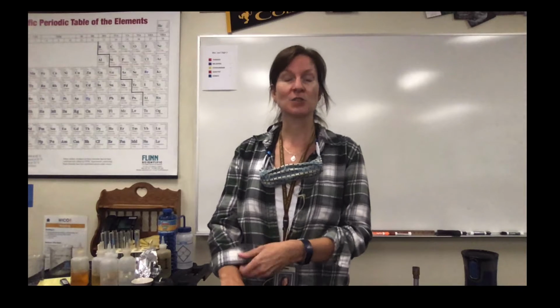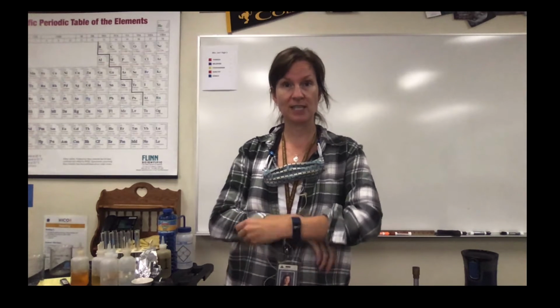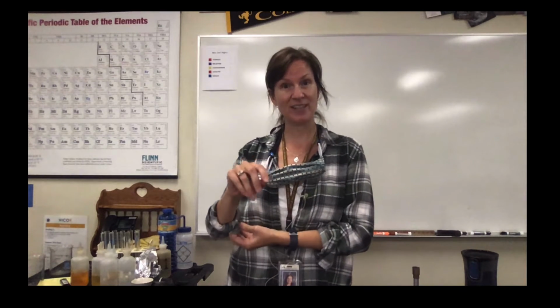This video will include all of the demonstrations done in class in relation to the chemical and physical change lab. So this is where you should go to watch all of them in order to fill out the lab. So do the pre-lab, then watch this to get all of the data, and then finish the lab.